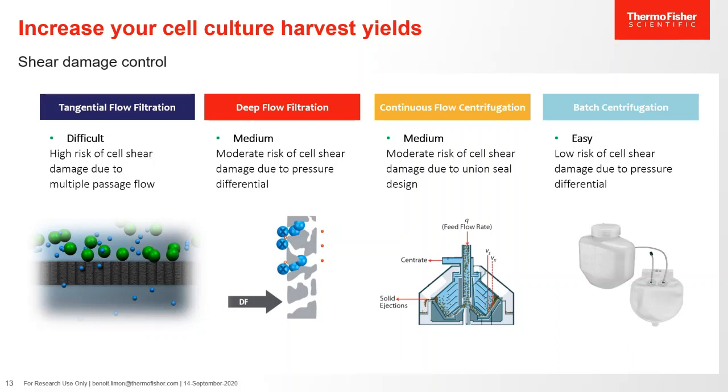And the risk is mainly due to the pressure differential caused by the G-force inside the container, which is easily controlled by adjusting the acceleration, the deceleration rate, as well as the rotation G-force.